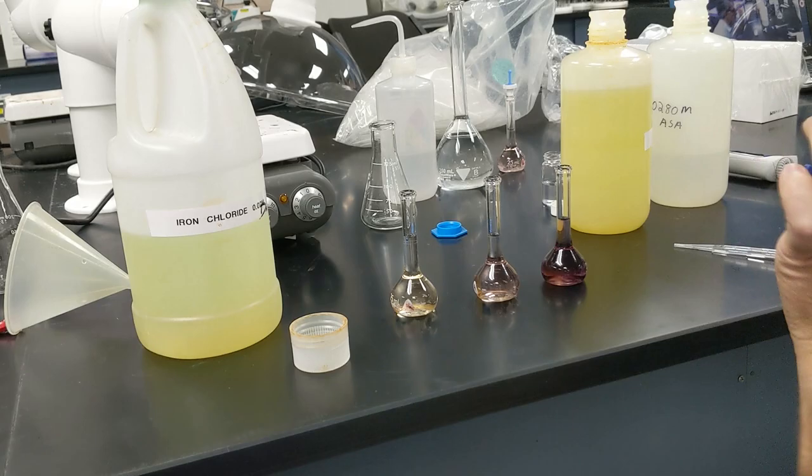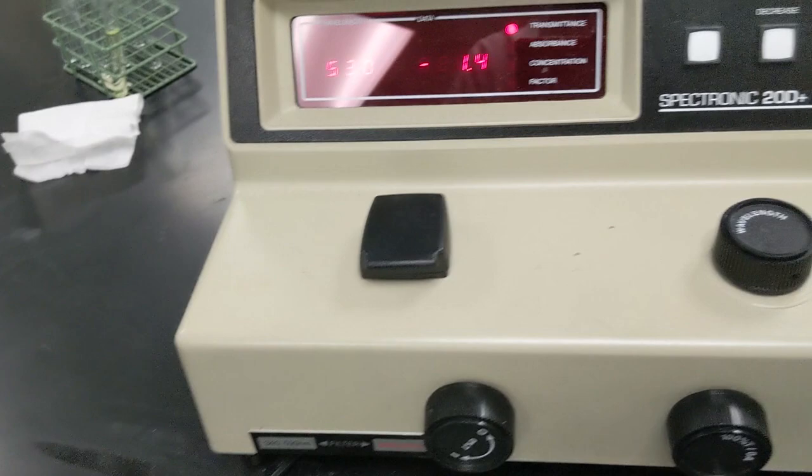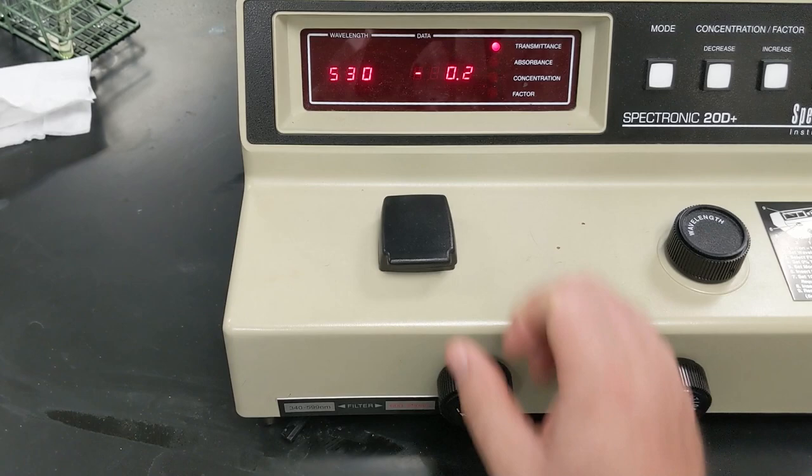All right, we're going to get the spectrophotometer ready here so we have it set to our correct 530 wavelength. And got the right filter on. We are going to then set this transmittance to 0. So let's make sure there's nothing in there. Okay. That hasn't happened before.